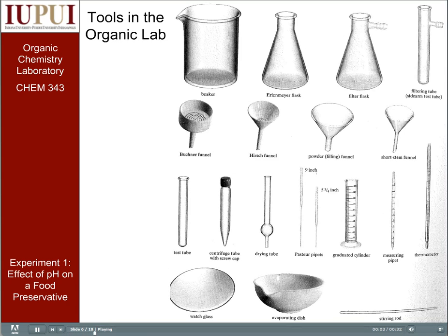So in order to go through those 5 steps, you guys are going to need some common lab tools. Some of the major glassware tools, a lot of these are probably familiar, are listed on the screen. So you've got anything that can hold an organic reaction, anything that can lead to separating things, maybe separating a solid from a liquid like some kind of filter. You've got things that are used for purification, and then we'll eventually see some tools that are used for analysis.